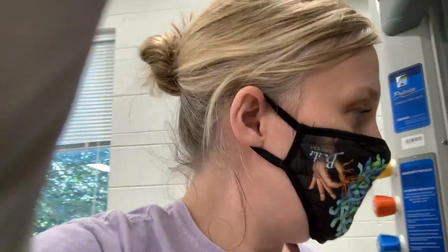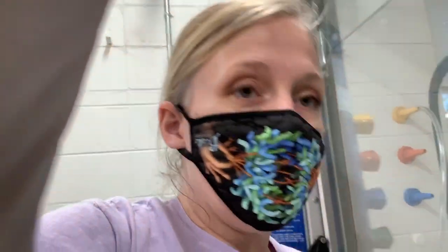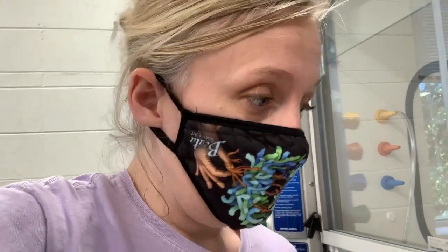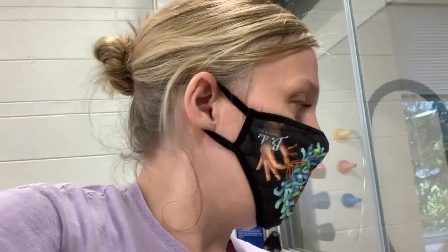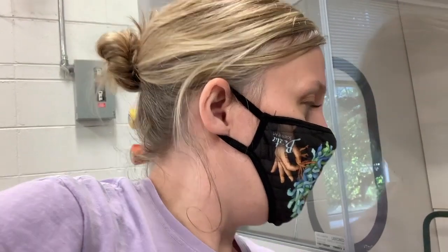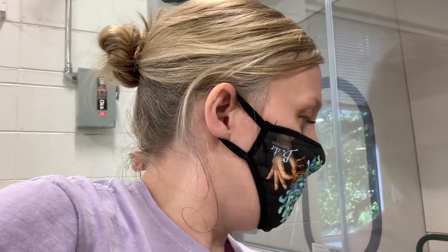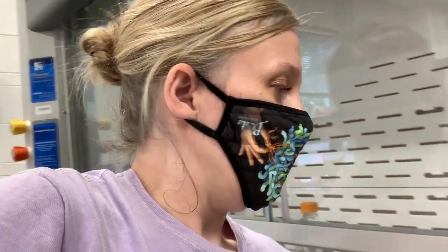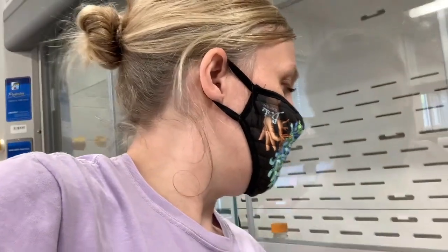So you really want to do a couple of things when you set this up. You want to make sure that you loosen your lids. You want to make sure that you set this up to stir in such a way that it doesn't make a lot of noise for your colleagues who work over here on this side of the lab. So you want to try to be really careful with the speed. You want to make sure you don't turn on the heat for these because you don't want to heat things.